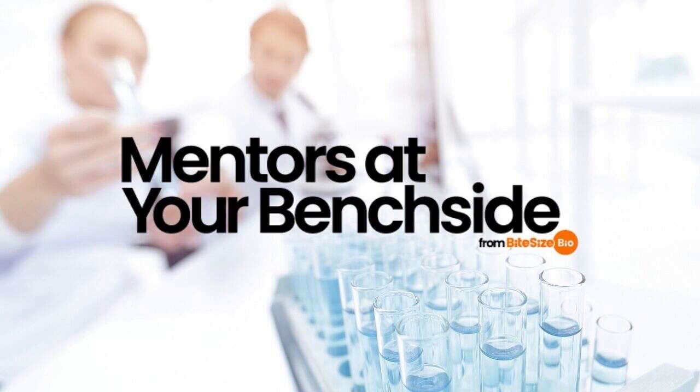The scanner. This unit is based on 2 or more mirrors which guide the focused laser beam across the sample specimen pixel by pixel and line by line, left to right, also known as raster scanning. The objective lens. These are the heart of the microscope and primarily determine the optical image formation and the resolution limits of the microscope.